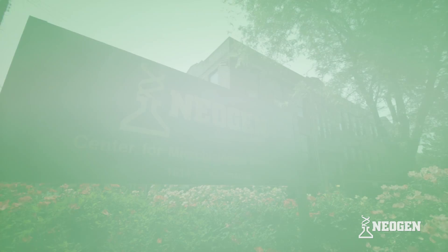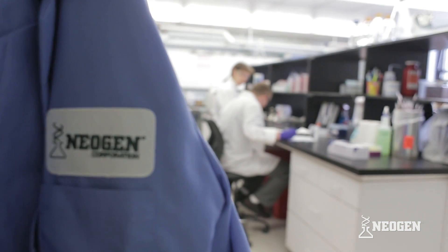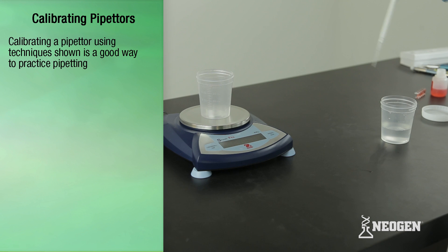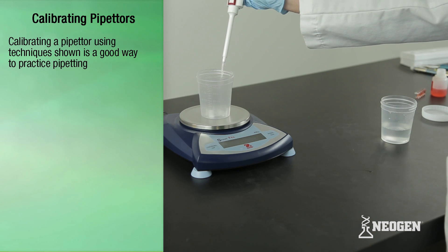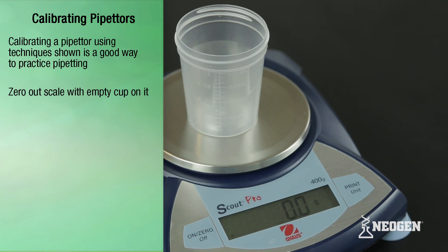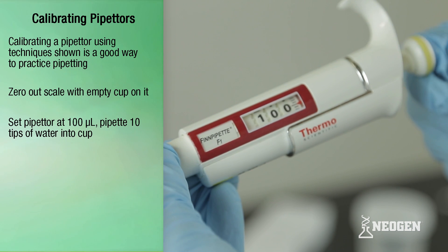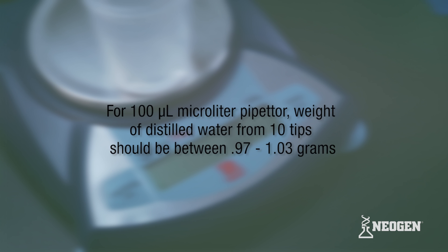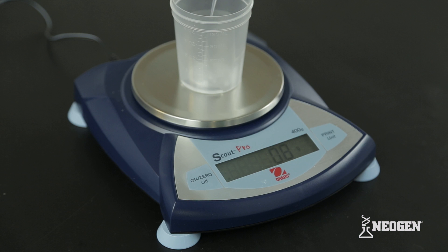Calibrating Pipetters. Neogen recommends calibrating your pipetters once every year. New pipetters come with calibration certificates that are good for one year from the date of first use. Calibrating pipetters using one of the methods described in this video is a good way to practice pipetting. To check calibration, zero out a sample cup on a scale, set the pipetter at 100 microliters, and pipet 10 tips of distilled water into the sample cup. For a 100 microliter pipetter, the weight should be between 0.97 and 1.03 grams. If the weight is outside of this range, the pipetter should be sent in for calibration.